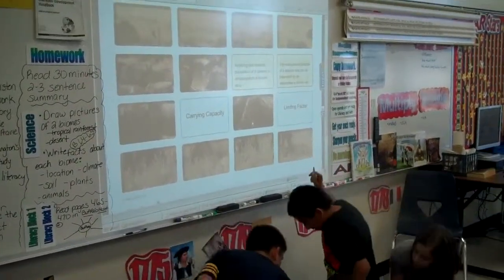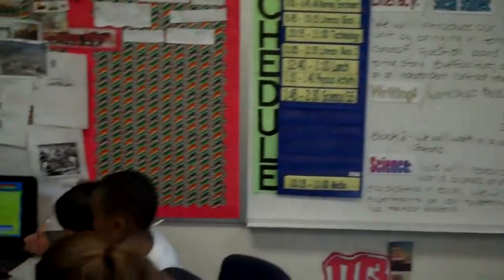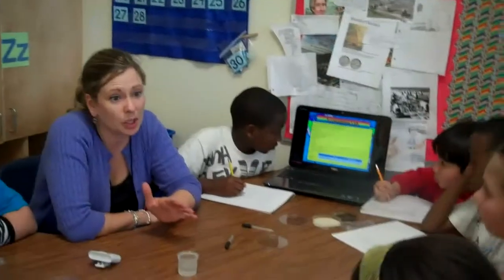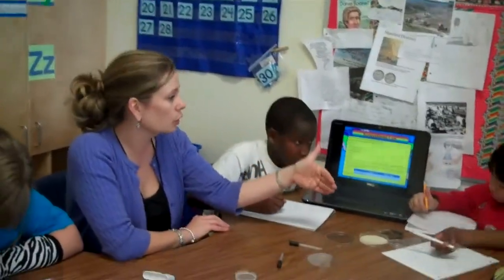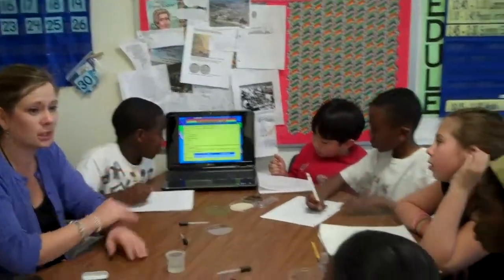You can decide on that in your group. Based on what we found when we did the experiment with the last group, it needs to be a little more. I would say probably 10 drops. If there are 3 of you, maybe you could do 3, 3, 3 and make it 9, or you could do 4, 4, 4 and make it 12. Somewhere in the 10 to 12 range.